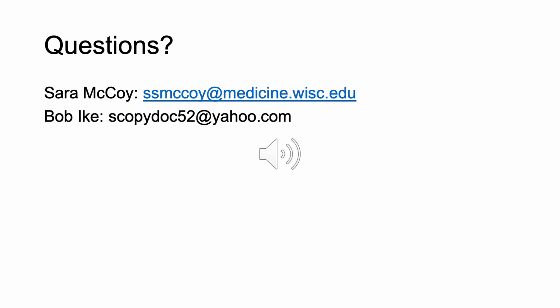So, as with UCSF and Hopkins, simply Google the institution and pathology and consultation, and you'll see how to get specimens to them. Note that for all of those places, glass slides are preferred, so you'll have your own home institution do the fixation and slicing and staining and placement on slides, and then transmit those slides for assessment if that's what you wish.